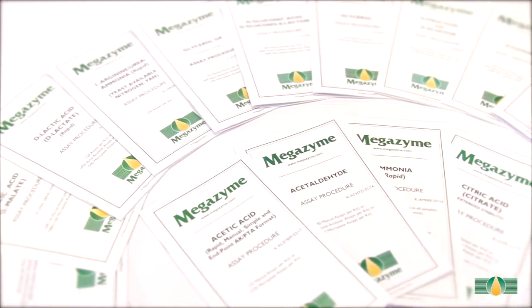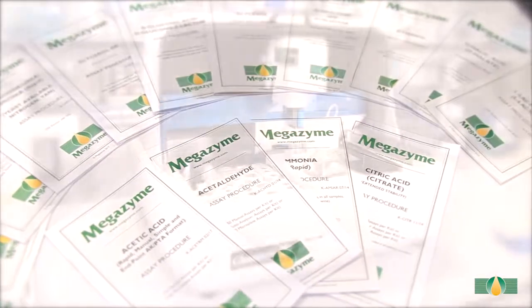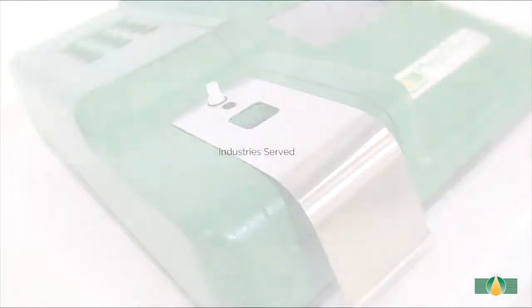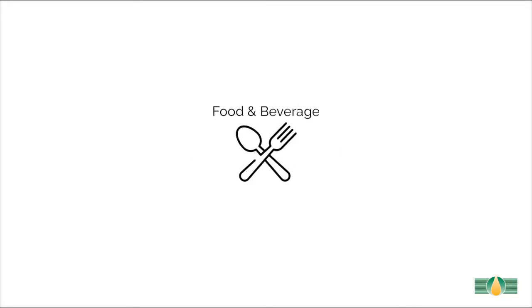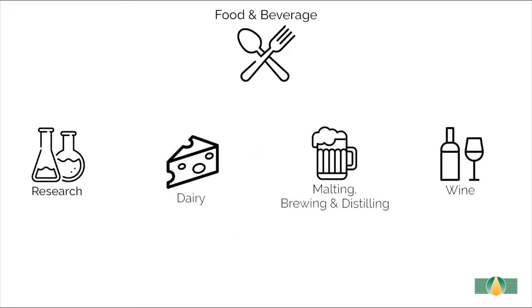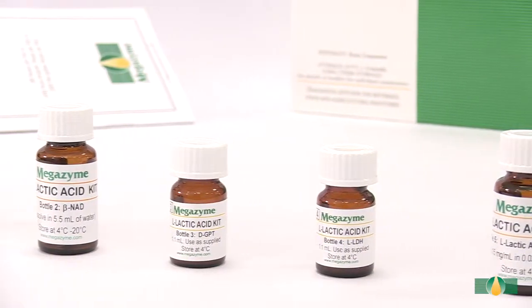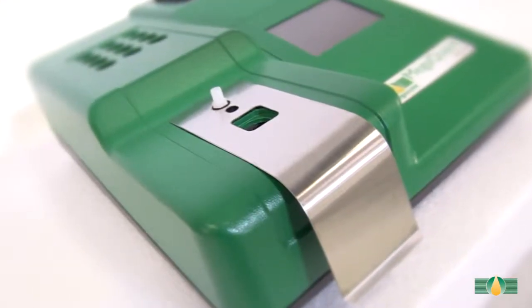Megazyme provides an extensive range of assay kits for use in various assay formats including autoanalyzer, microplate, and manual spectrophotometer. This L-lactic acid assay kit can be used to accurately measure L-lactic acid in various sample types throughout industries such as food, dairy and beverages. This video tutorial will demonstrate the use of the assay kit with a wine sample using the manual spectrophotometer format.